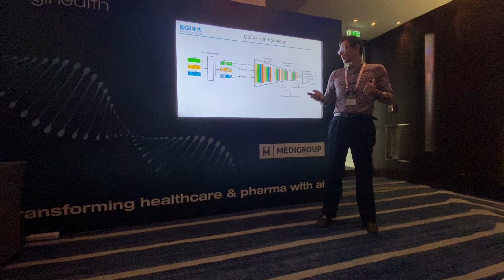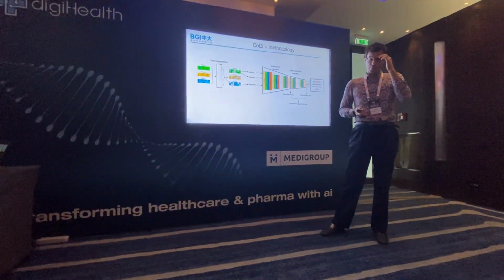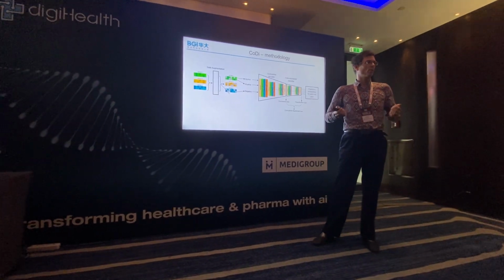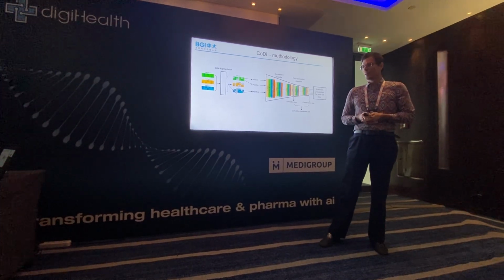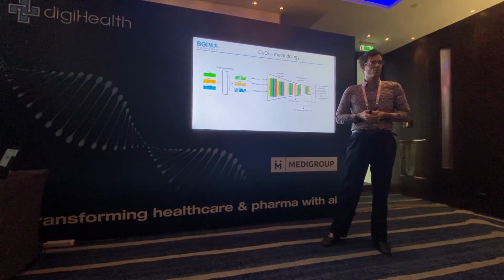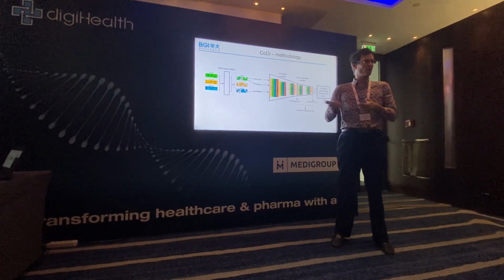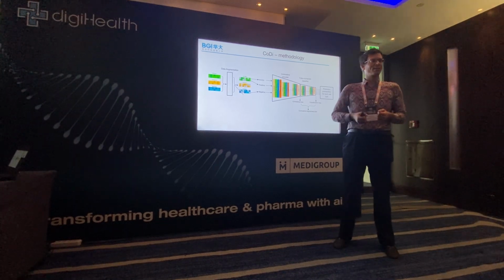When we were selecting the deep learning architecture, we had some thoughts and discussions about what could be used, and of course the latest trend for large language models suggested we should go for it. Everybody is using it. You know, the reviewers of the paper would love it. So no, we didn't go for it.